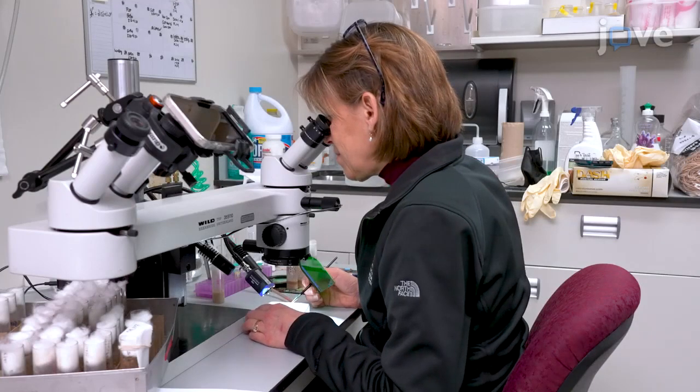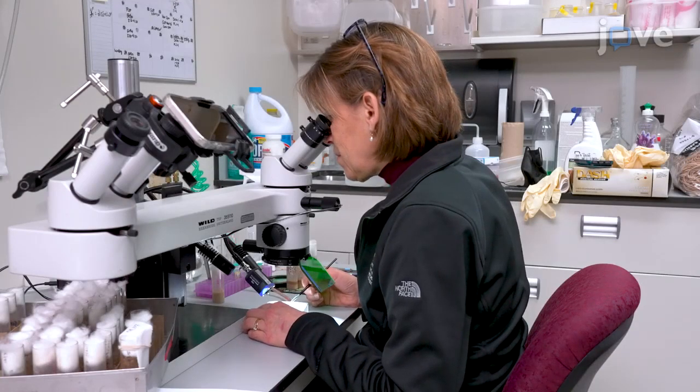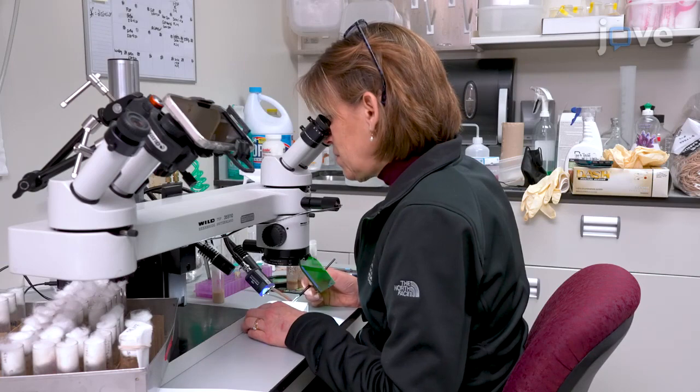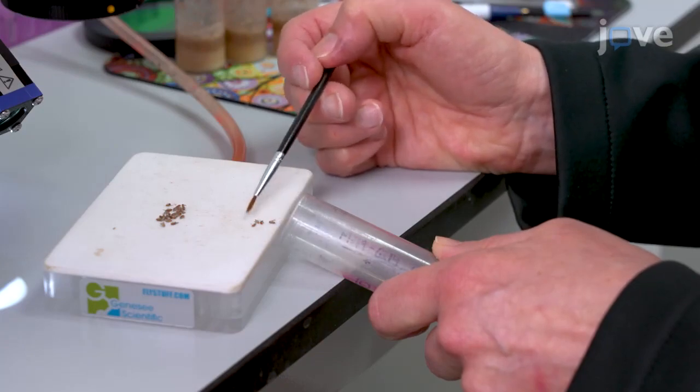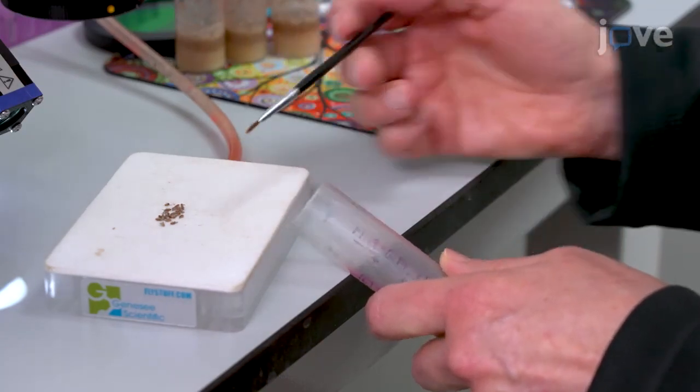After anesthetizing the flies on a carbon dioxide pad, sort newly eclosed F1 young male flies within 6 hours of eclosion and place them in clean vials containing food with 40 or fewer flies per vial.